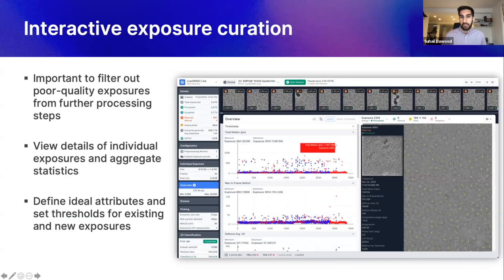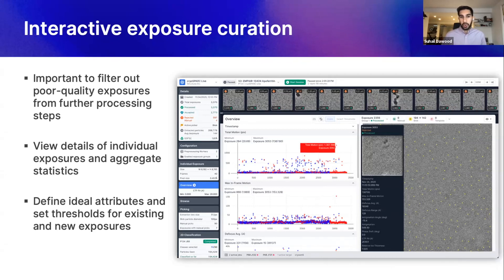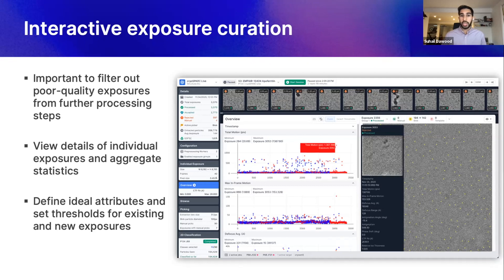Another key component to the CryoEM processing pipeline is exposure curation. The ability to filter out poor quality exposures from further processing steps is critical to optimize processing and attain a high-resolution structure. Usually curating datasets is quite tedious and is done after data has been collected. In CryoSpark Live, we've designed an interactive curation tool that allows you to set thresholds and apply them to all exposures in the session. You can filter based on many exposure attributes such as the amount of motion, CTF quality, ice thickness, and number of particle picks. These thresholds also apply to new exposures being processed, ensuring that the standard of quality you define is carried throughout the entire data collection session.